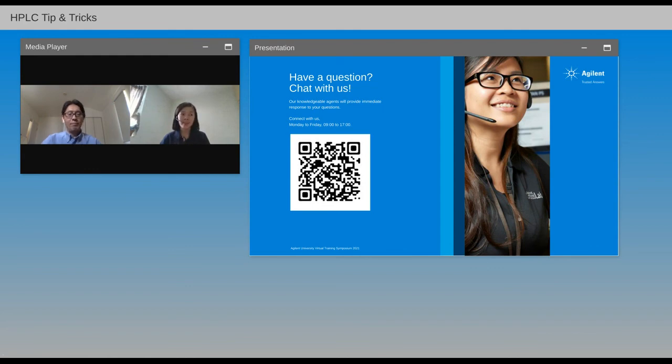Yeah, thank you. Okay, thank you, Joanne. There's another question. What is an ideal equilibrating time before running at starting conditions of your method?